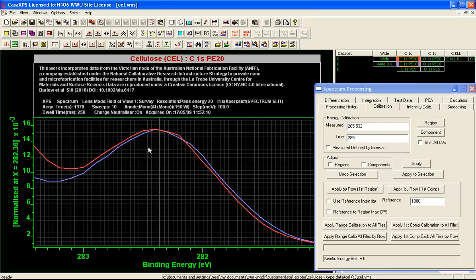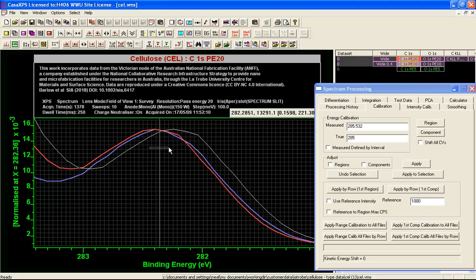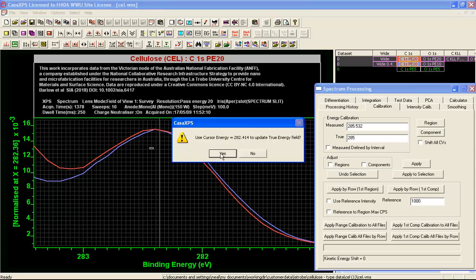And I can do this by holding the control key down, and when I hold the control key down and I can slide the mouse, then you can see that an image of the red spectrum then slides, so I can then by eye choose an adjustment, and the adjustment in terms of offset is a rather small one.